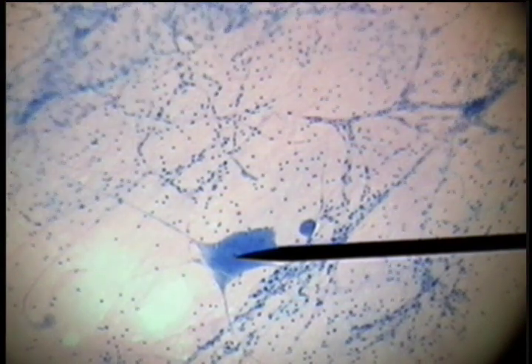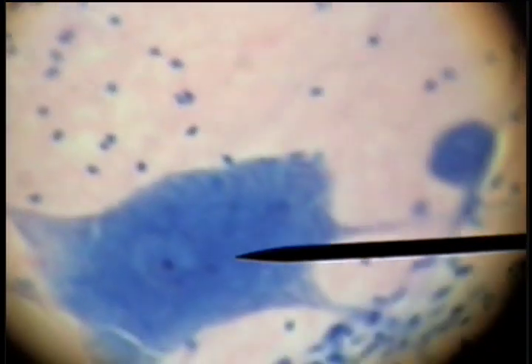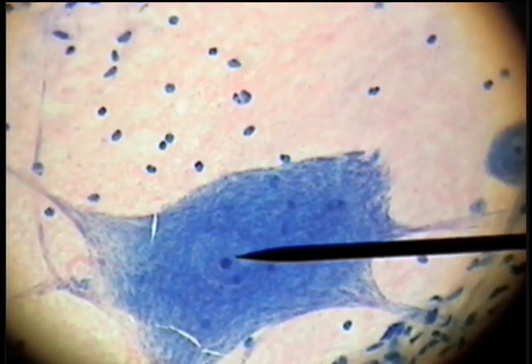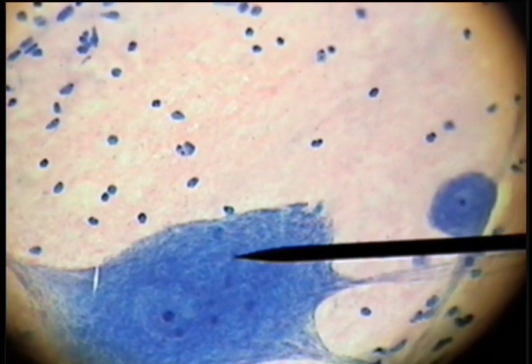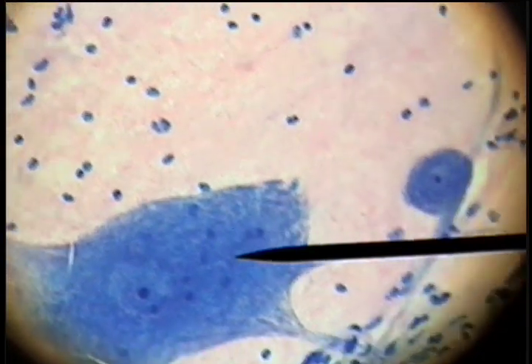We can just barely see the dark nucleolus in the center and the lighter nucleus. On higher power, we can see a little clearer — here's the nucleolus and the lighter nucleus, and then the Nissl bodies, which are these dark granules. These are rough endoplasmic reticulum.